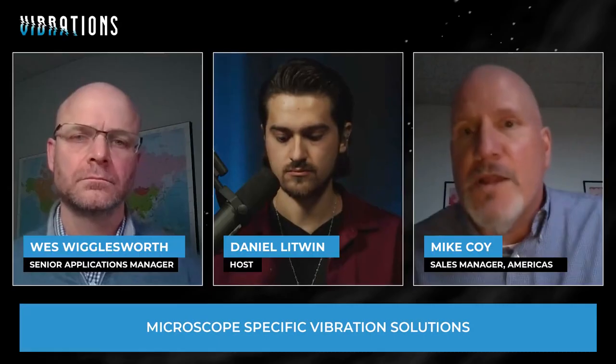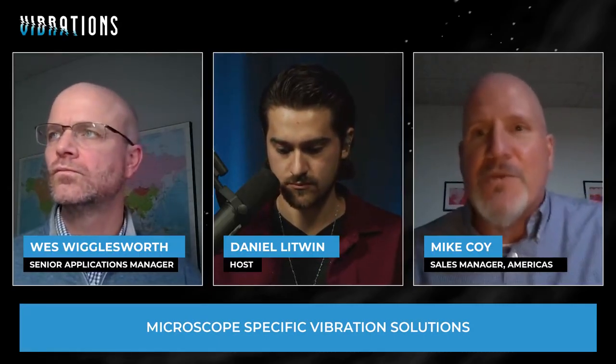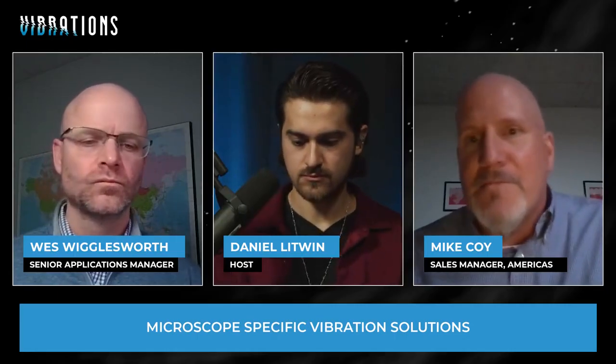A lot of times these are periodic. You work on the instrument at night, you come into the lab at 10 p.m. when it's quiet, everything's beautiful. You come in the next day, you try to work at 11 a.m. when everybody in all the labs around you, above you, behind you is working, and your performance is not at the same level. So these are all very clear-cut indications of something in the environment impacting the performance of the instrument.